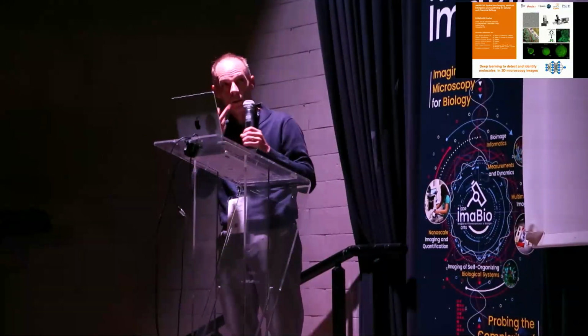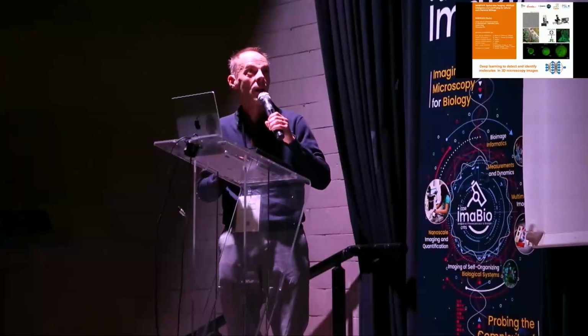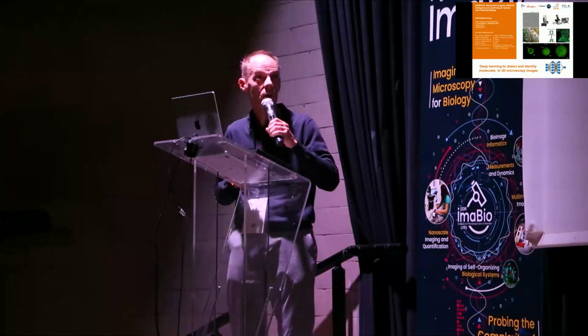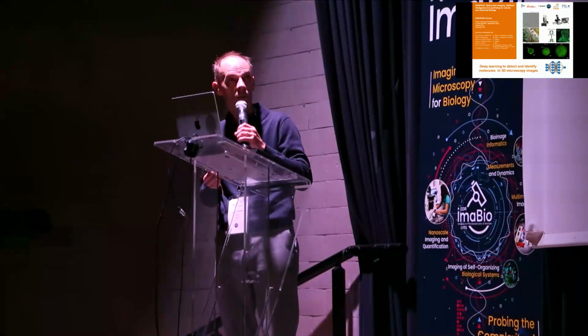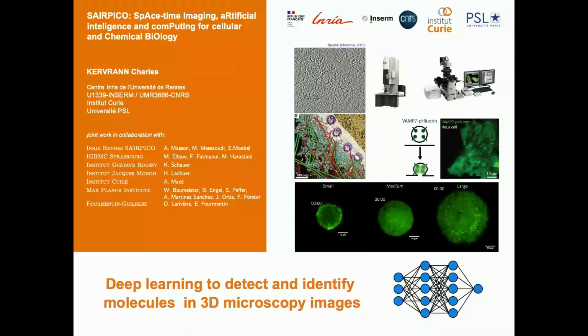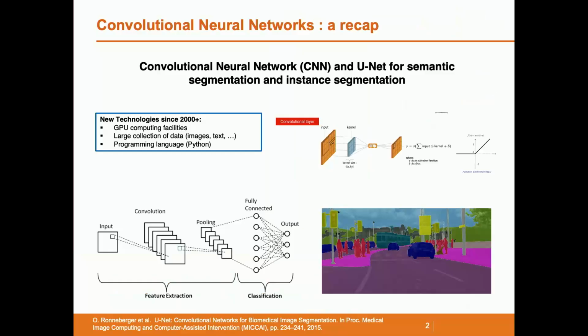I guess that you are not so familiar with this technology, which can produce very spectacular results, but also represents serious challenges in image processing. And then we will show you that this methodology can be adapted to detect very rare events, exocytosis events observed in TIRF microscopy.